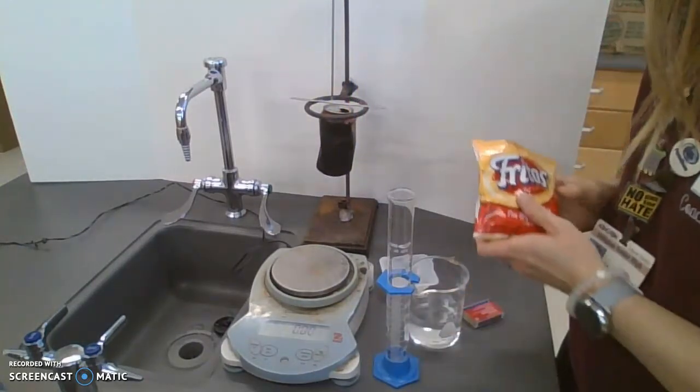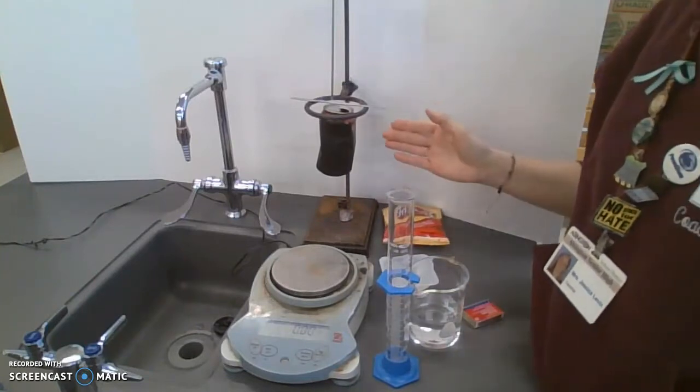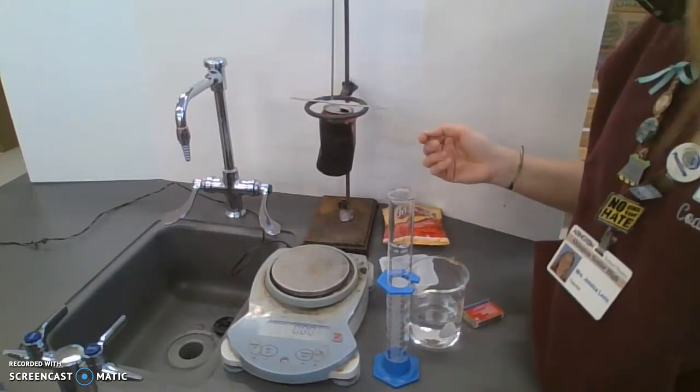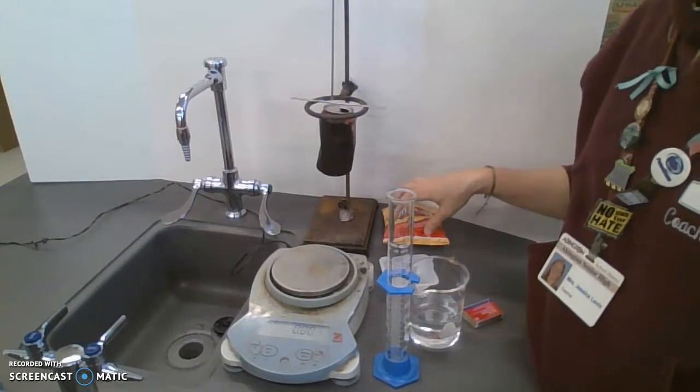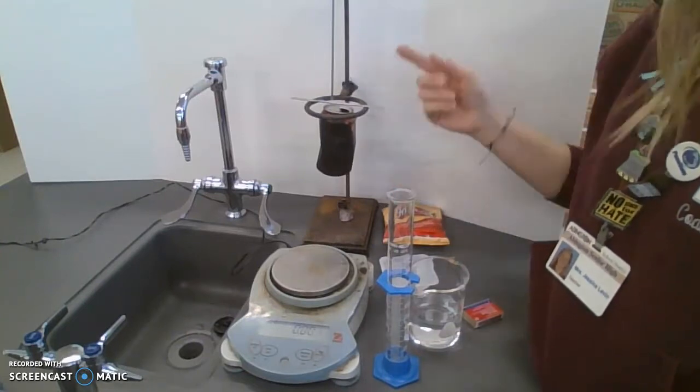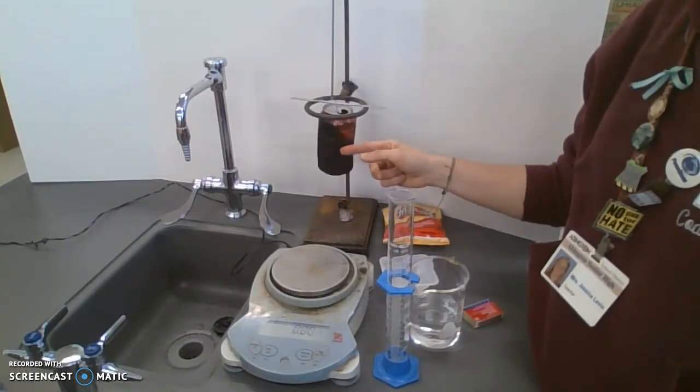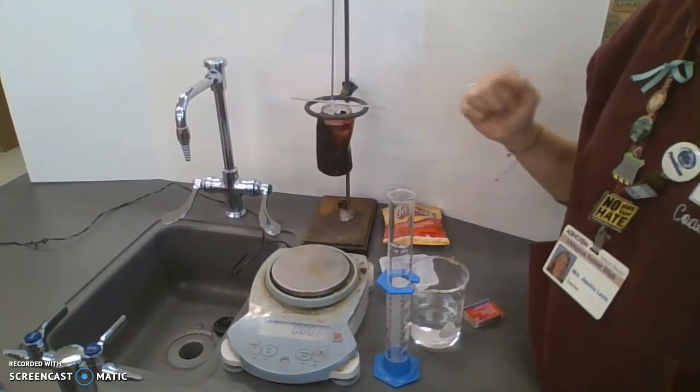So what we're going to do is show you what happens in the Food and Drug Administration when they end up doing these food labels by using a soda can calorimeter.